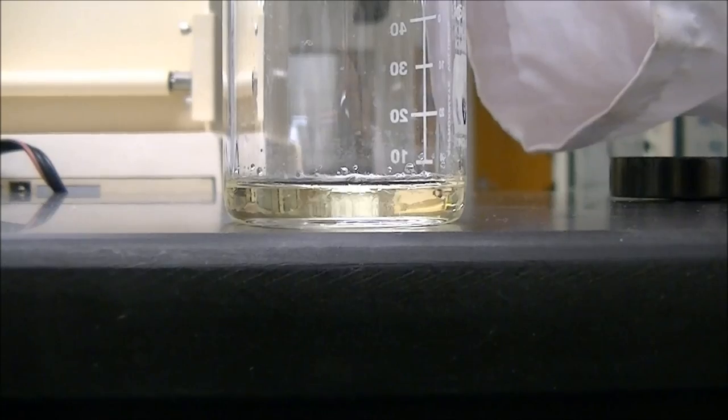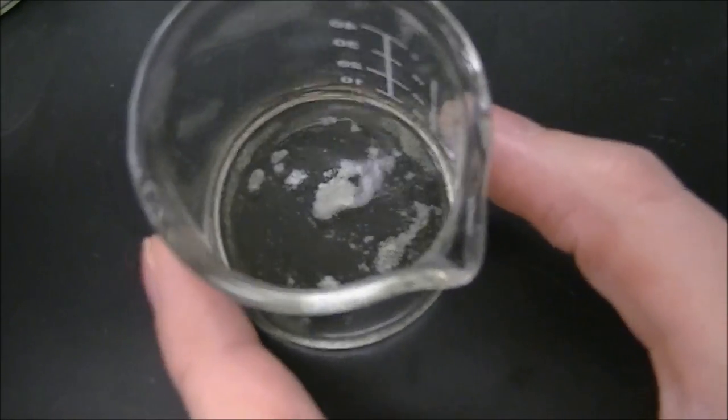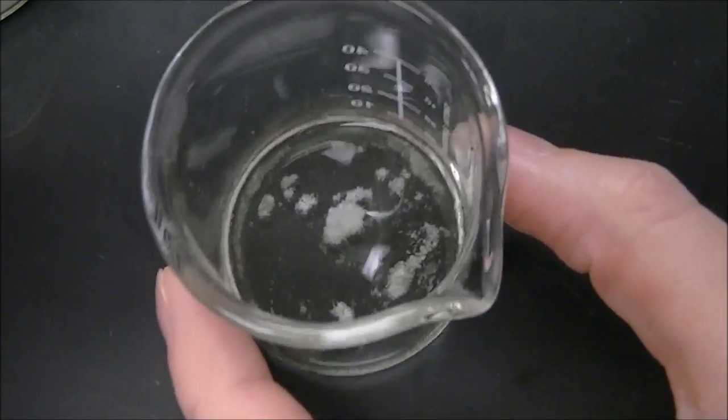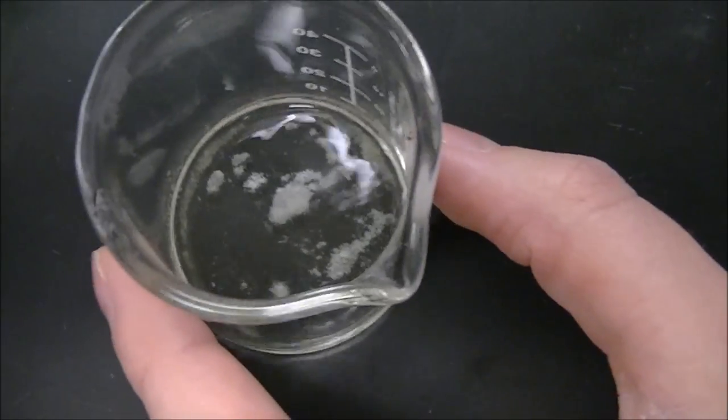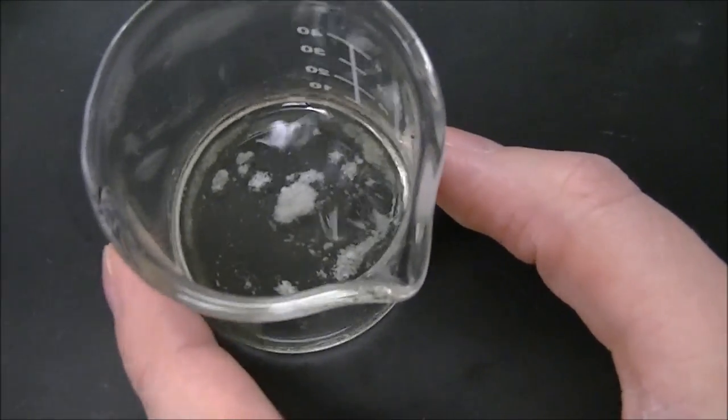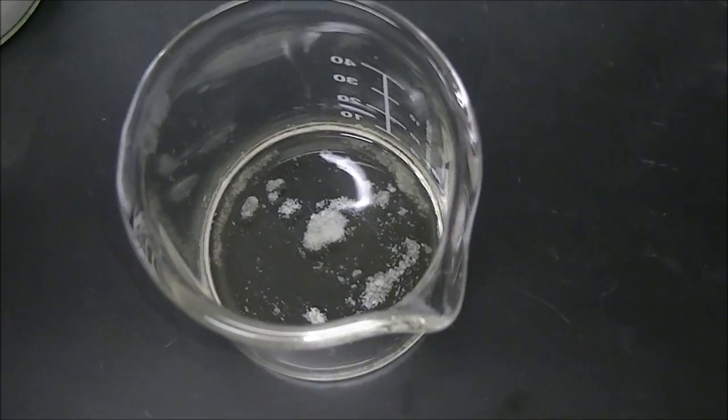As you pour in your sodium sulfate, you'll see that it starts to clump up on the bottom. So as we're swirling it, you can see that the clumps aren't moving. That means that there is water in our solution. And we're going to keep putting in anhydrous sodium sulfate until we get kind of floaty pieces. That means that that anhydrous sodium sulfate isn't grabbing any more water.